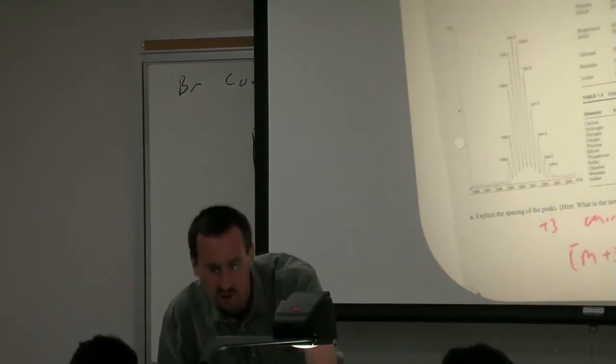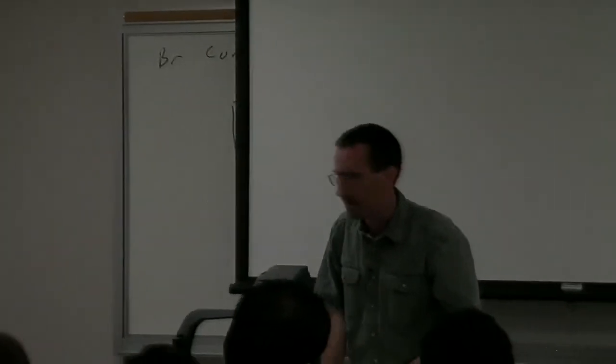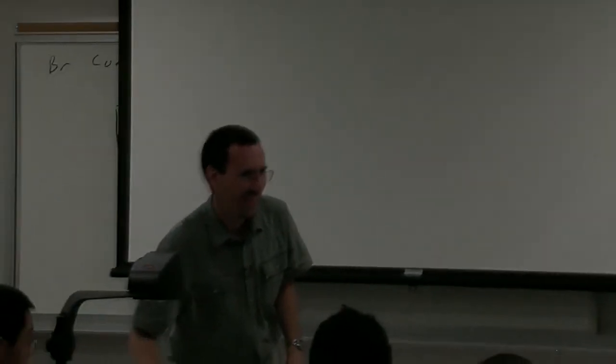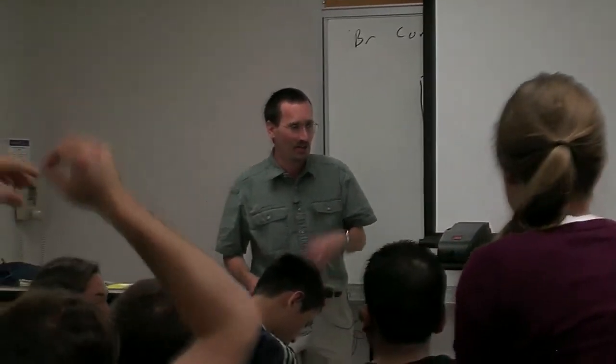All right, well, that will get you started on that last problem. It's all conceptual. It's all something that just involves really exploring this idea of what exact masses and isotopic abundances are. It's more like an NMR multiplet. And for those of you who go on, absolutely fascinating patterns from ruthenium compounds and osmium compounds and compounds with multiple rutheniums or multiple osmiums.